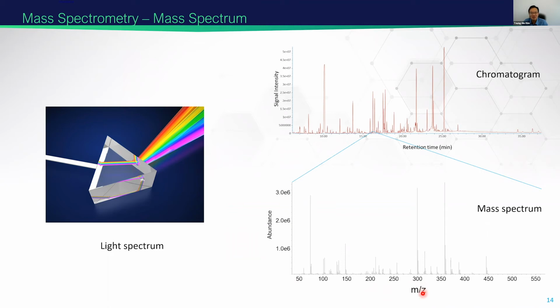In general, in GC-MS or LC-MS, we mostly see just one charge state. But yesterday, with top-down proteomics, we saw highly multiply charged proteins, because their moieties can get additional protons. So we can see this mass spectrum at some point.